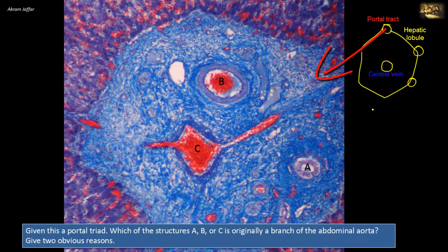The portal tract contains a terminal branch of the portal vein, a terminal branch of the hepatic artery, and a bile ductule, or a tributary of the bile duct. They also contain lymphatic vessels, but since the walls of lymphatic vessels are delicate and often collapsed, they are less easily identified.